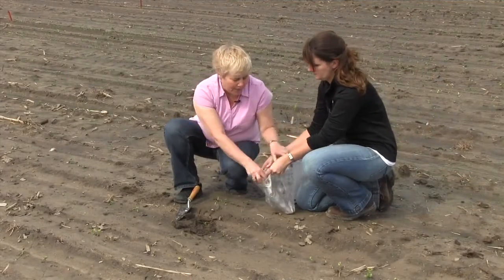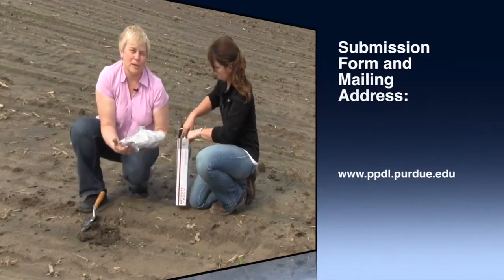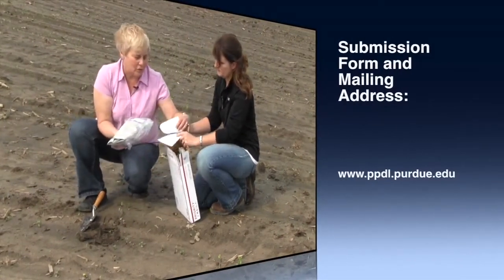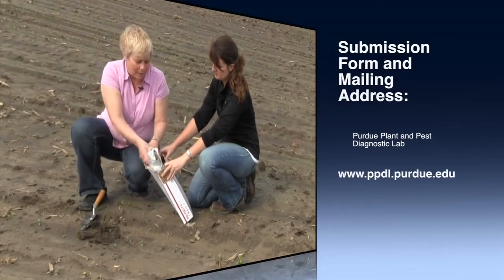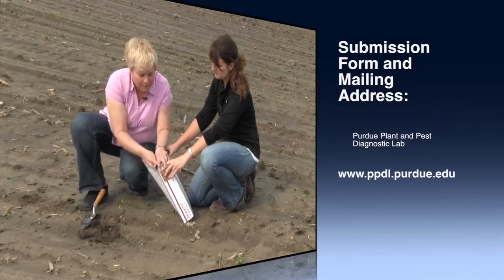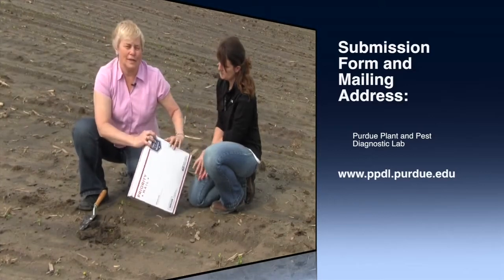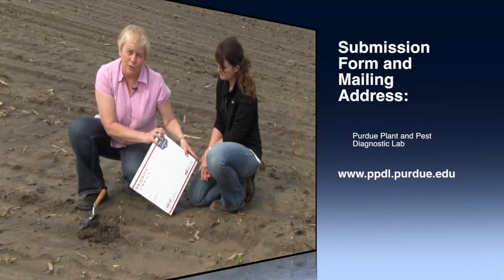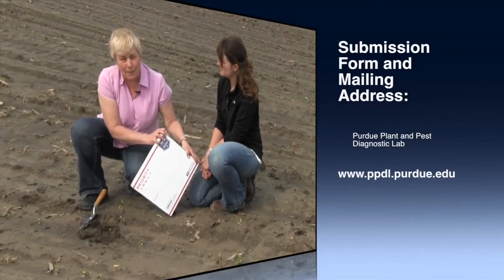So you take the newspaper, put it into a plastic bag, have your submission form that you have filled out, that you've downloaded from the web, a filled out submission form with all the background information, and then put it into the box with crumpled up newspaper so as to keep the sample from moving around in the box. And you'll notice that we're using a box that's either Priority or FedEx. We like you to ship overnight mail to get the sample to us in the best condition as possible.